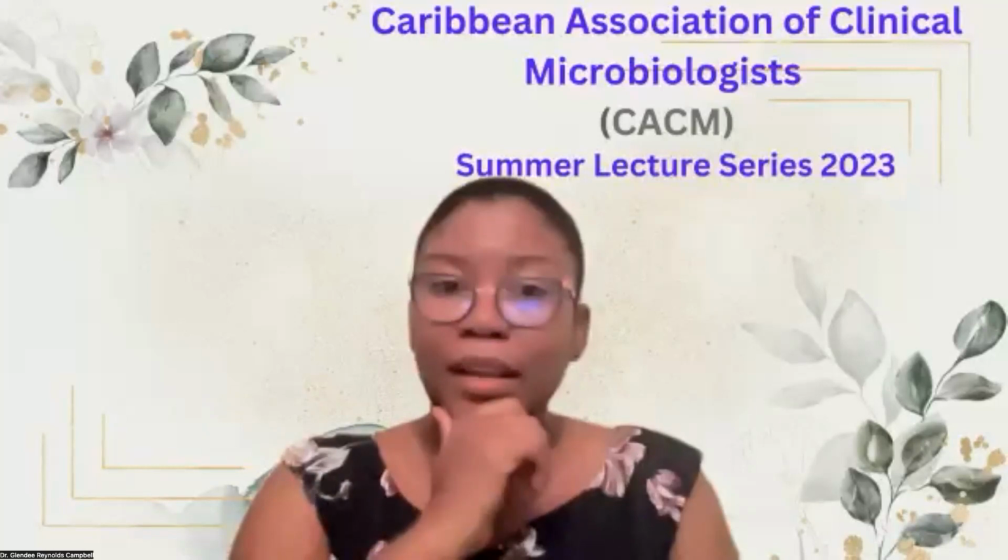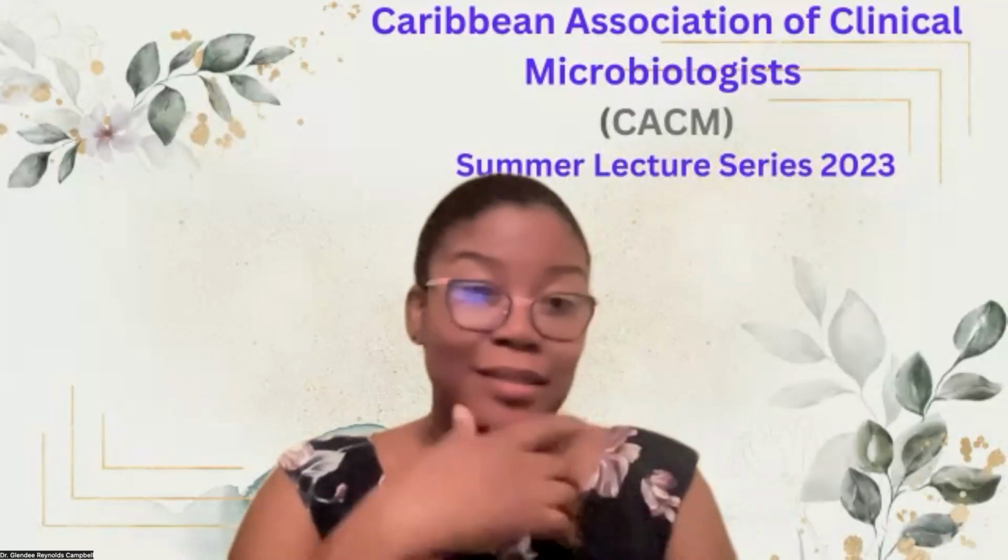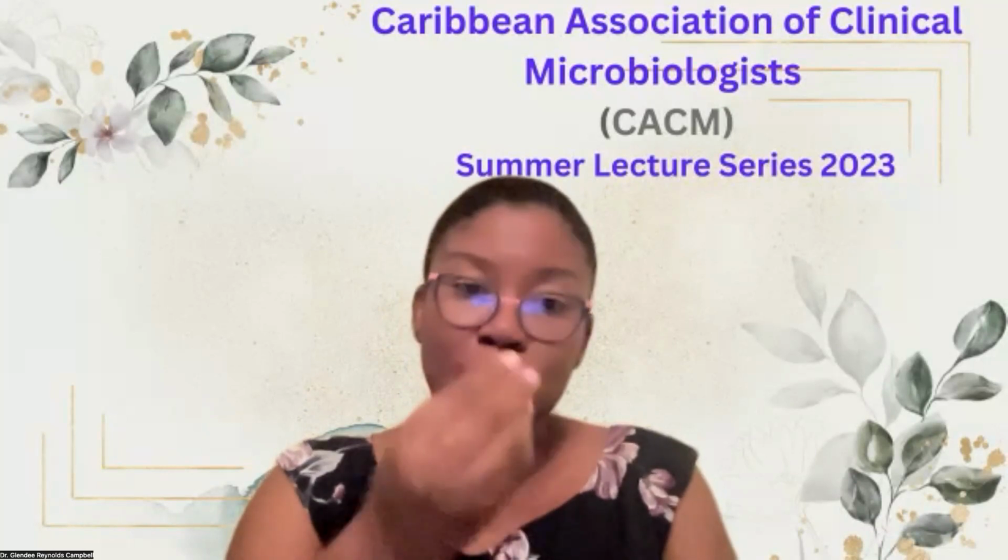Yeah. And that's a very good consideration. I've been to places where at times, because of the equipment and the small spaces that they have, the staff may not even be able to keep a coat on all day. They may wear scrubs instead, but then sometimes they may wear those scrubs out of the lab, which is a no-no. So having a disposable coat over, and especially the lighter material ones, shouldn't generate much heat. So this is actually a good option in such a scenario.